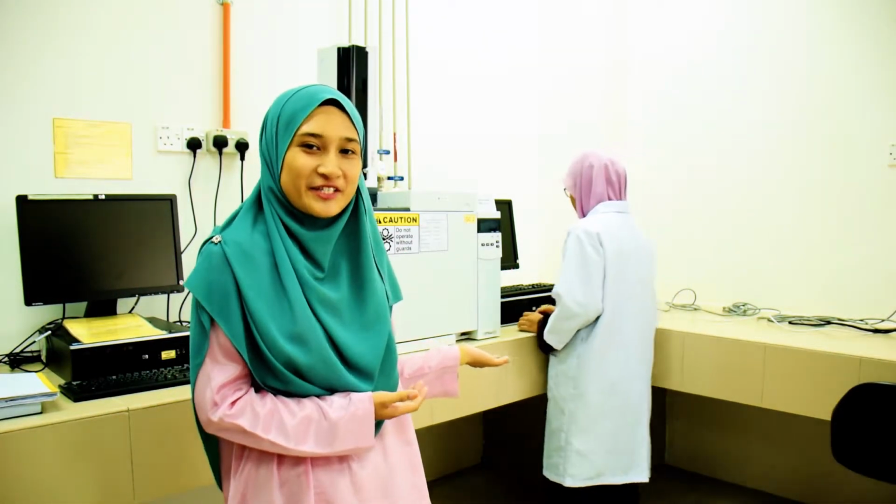GC is an analytical instrument that measures the content of various components in a sample. The analysis performed by a gas chromatograph is called gas chromatography. During analysis, components of a sample are dissolved in a solvent. It is then vaporized to separate the analytes into two phases, stationary and mobile phase.